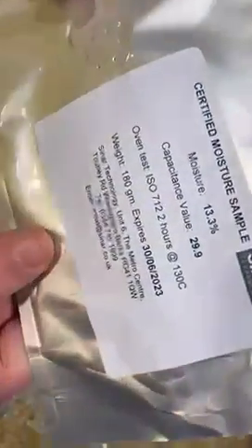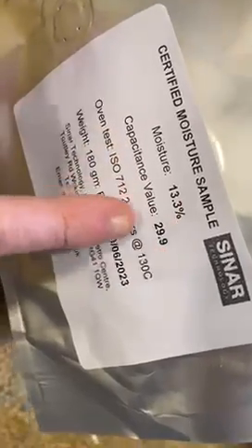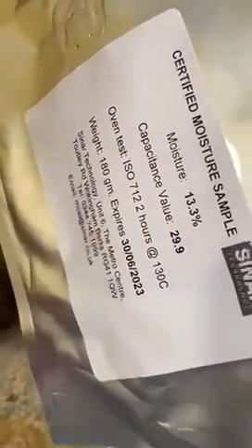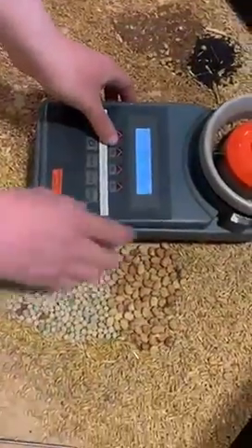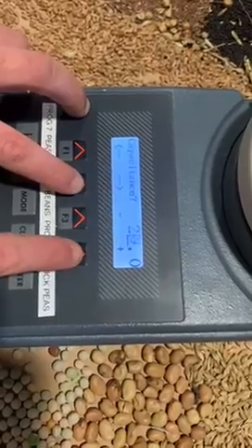On each of the samples, there is a value of moisture and capacitance. The capacitance value is what is used for calibration. Here it says 299, so on the machine, using the arrows, we can scroll over and type in 299.